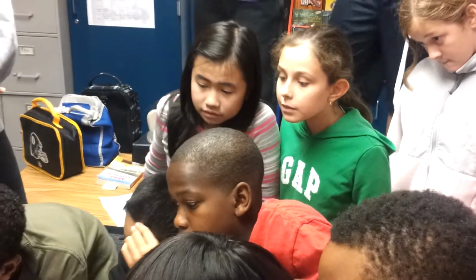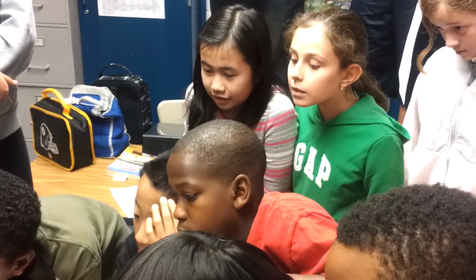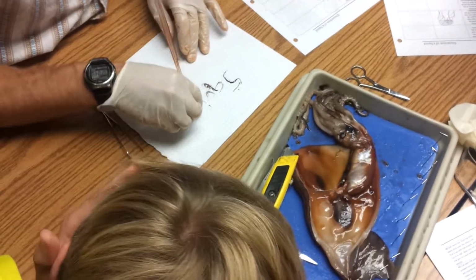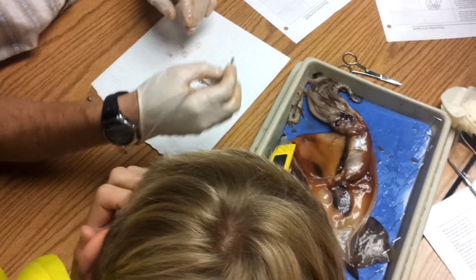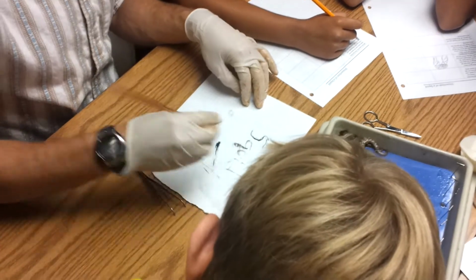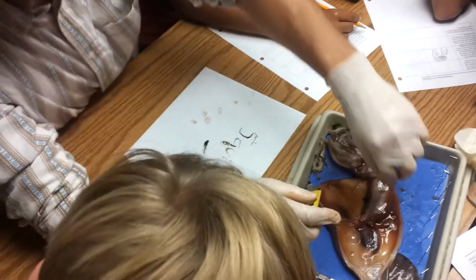Okay? And we can write squid. Squid was here. Great squid is very valuable. I want to keep it. Oh, look what comes out right there. So it's not a great pen, but you can see how dark this ink is. Can I get my pencil in it? You can actually draw with it. Okay? All right.